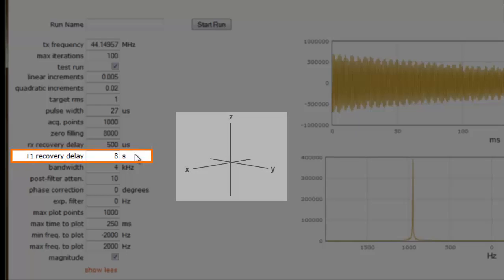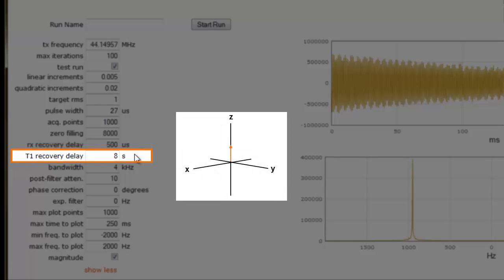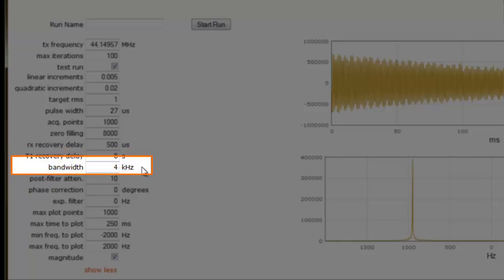Another important parameter is the T1 recovery delay. Here it is set to 8 seconds. This means there is an 8 second delay between each pulse that is executed. We have our bandwidth set to 4 kHz, and a corresponding post-filter attenuation value of 10.